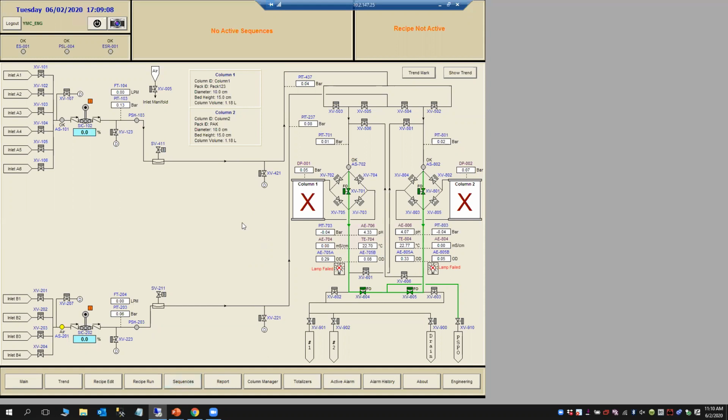And again, we will provide you the insights on how our automation platform works in terms of recipe creation. So our new YMC-based software, which is included as part of HMI, includes two blocks here in the footer of the screen, as you can see, one of which says recipe edit and the second one is recipe run.